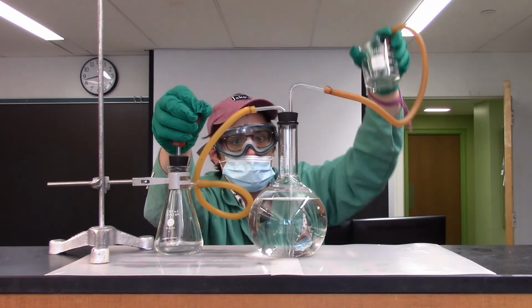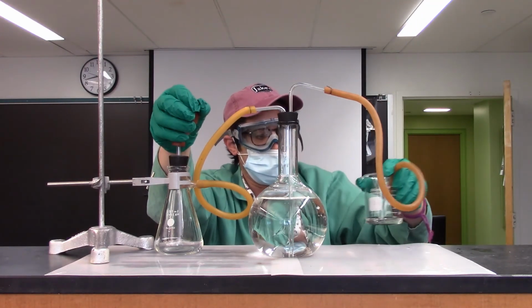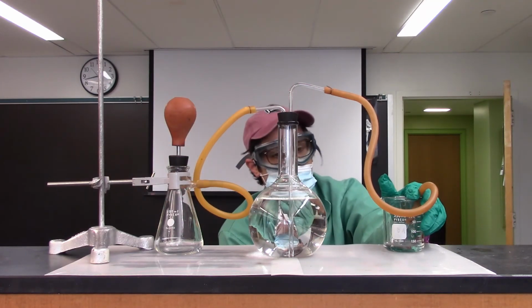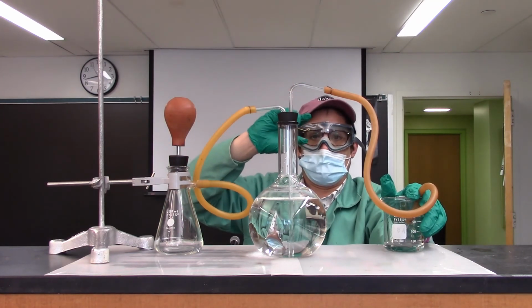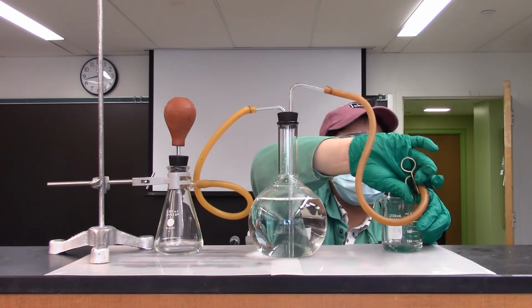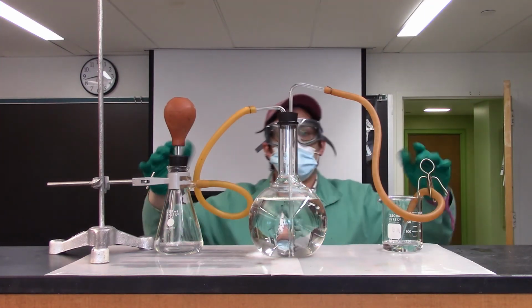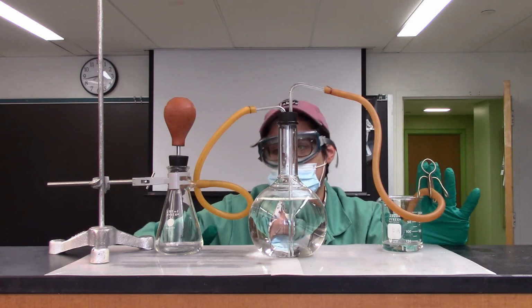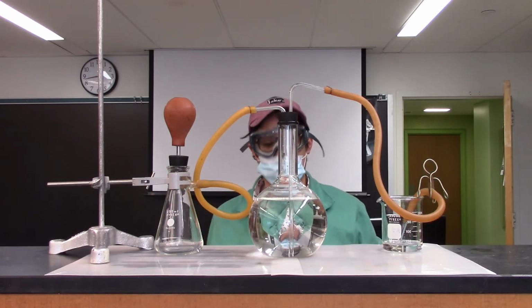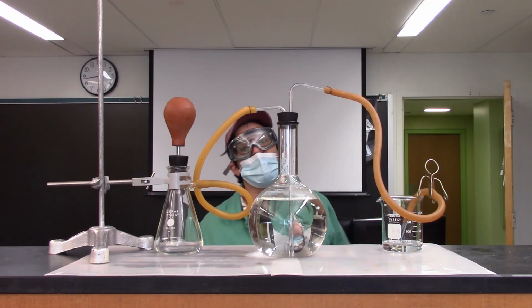Good. So as per the directions, I'm going to do this, which now has ensured that I've purged my entire system. I'm then going to clamp this right here so that when I start the reaction, I can unclamp, stick my thermometer in, and then allow everything to be displaced. So that is the setup for this lab. Now I'm going to move on to the experimental.